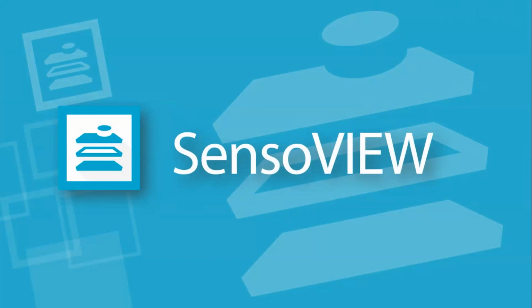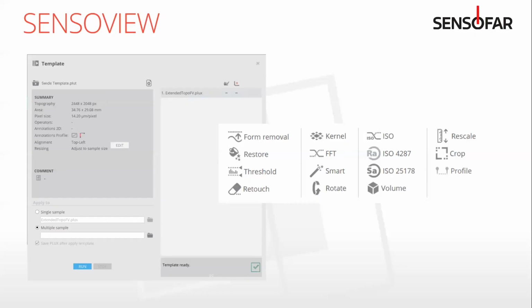The first program I want to go over is Senso View. Senso View is our basic viewing software. It's very powerful. It's not quite as automated as the other solutions, but you can still accomplish a fair amount with it. So we've got a template manager here. And that template manager can be used to save any number of operators that are done on your scan. So you can see some of them here. You can remove the form, restore, threshold out certain heights that you don't want. You can do basic roughness or profile roughness analysis and take volume measurements.